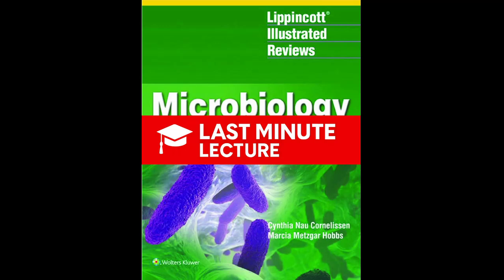And the star of this show is the Gram stain. Everyone's heard of it, but the book breaks it down so well. It's about their armor, isn't it? That's the perfect analogy. It's all about the cell wall. So first, you hit the slide with crystal violet dye. Everything turns purple. Then you add iodine, which is a mordant. It kind of locks that purple dye in place. Then comes the most important part, the acetone, the decolorizer.